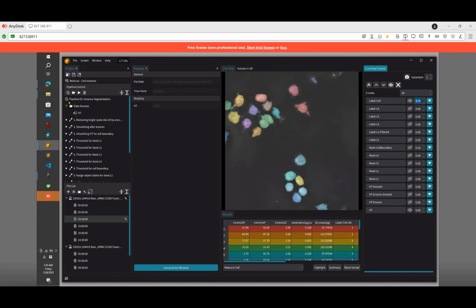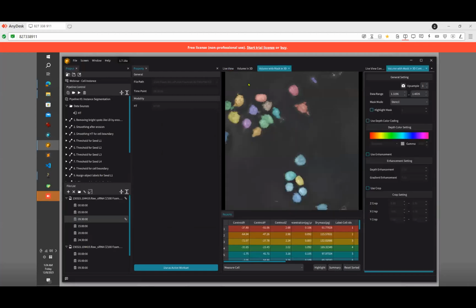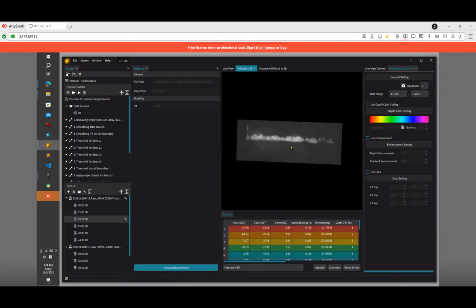And when you get this kind of segmentation, you do the visualization again based on the labels that you made. Before, it was like this. On this side, you may identify some very vague patterns, which is the missing information that tomography loses.